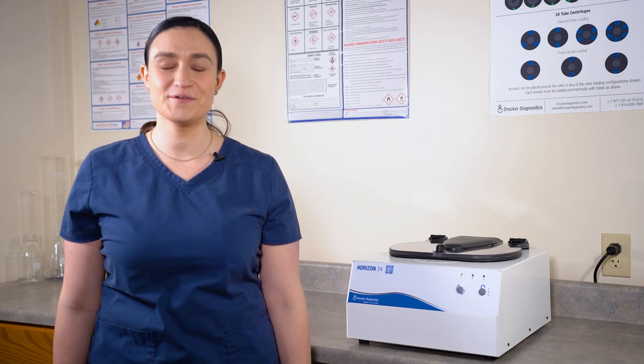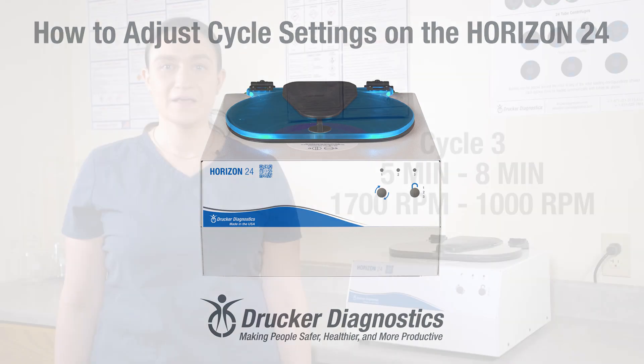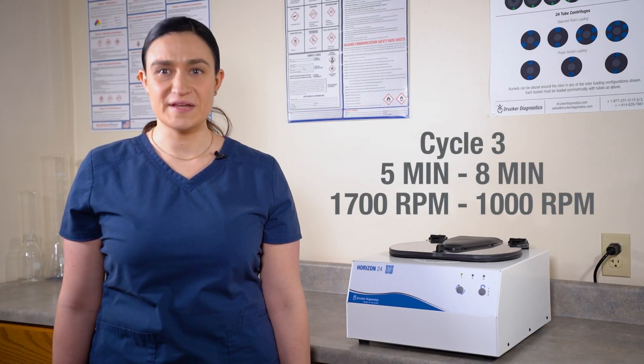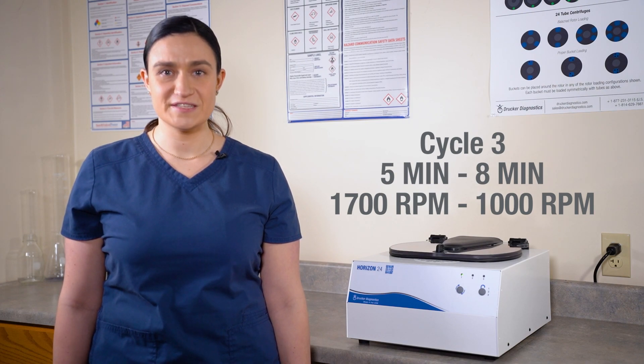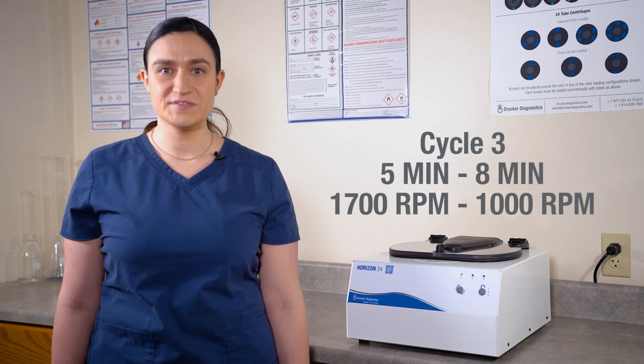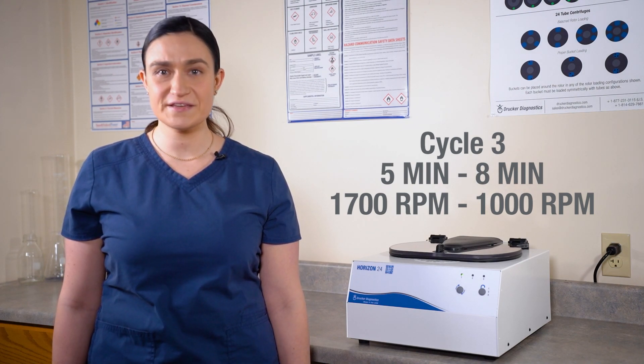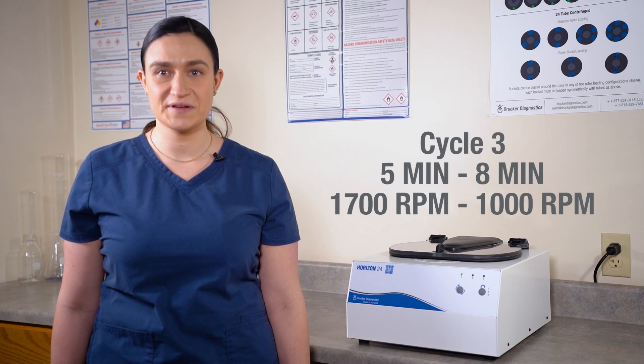Hi, I'm Dawn with Drucker Diagnostics, and today we're going to adjust the cycle settings on the Horizon 24 centrifuge. We're going to change preset 3 from 5 minutes to 8 minutes spin time, and from 1700 to 1000 RPM spin speed, but you can use this same process to change any of the three presets on your Horizon 24 to whatever you would like.